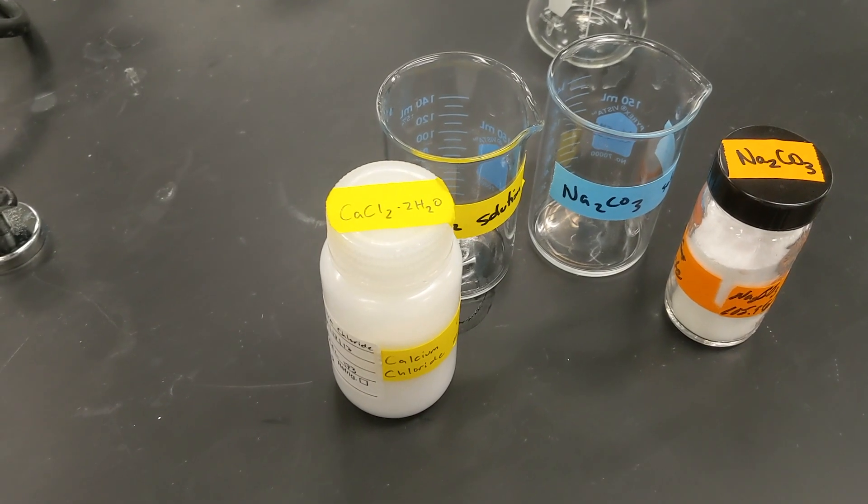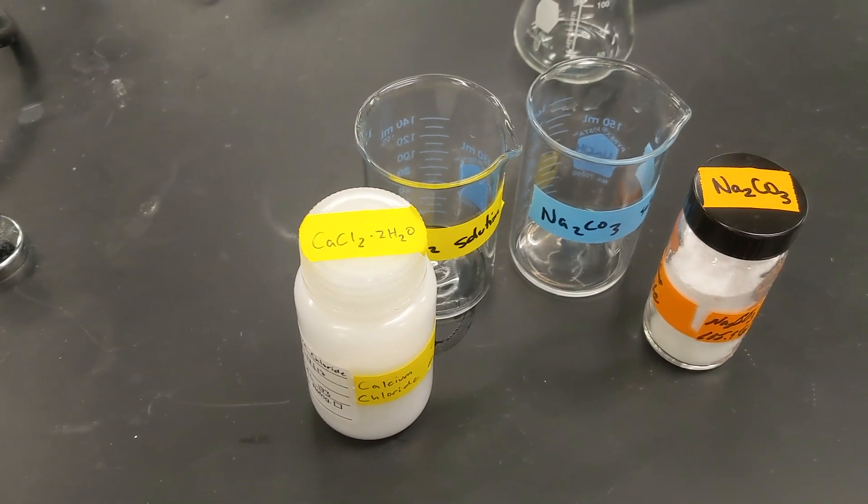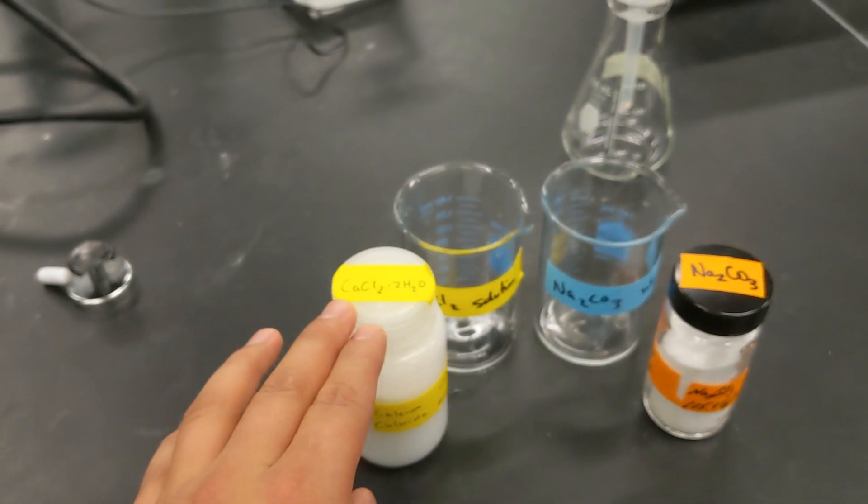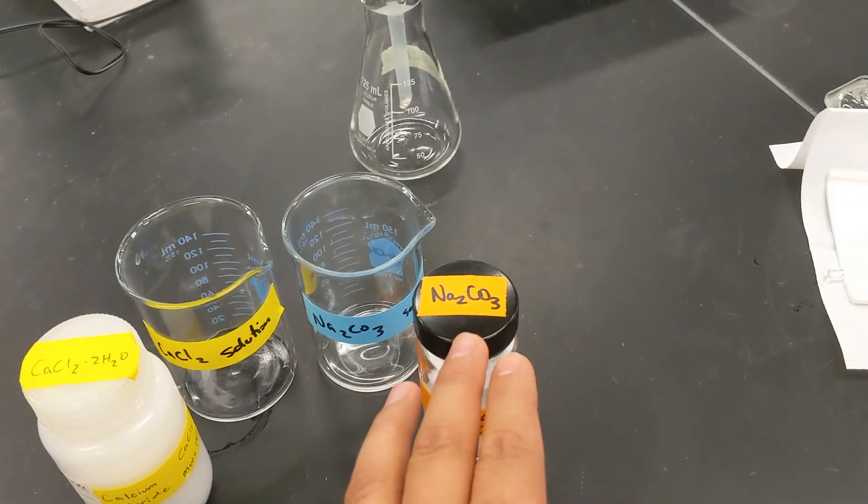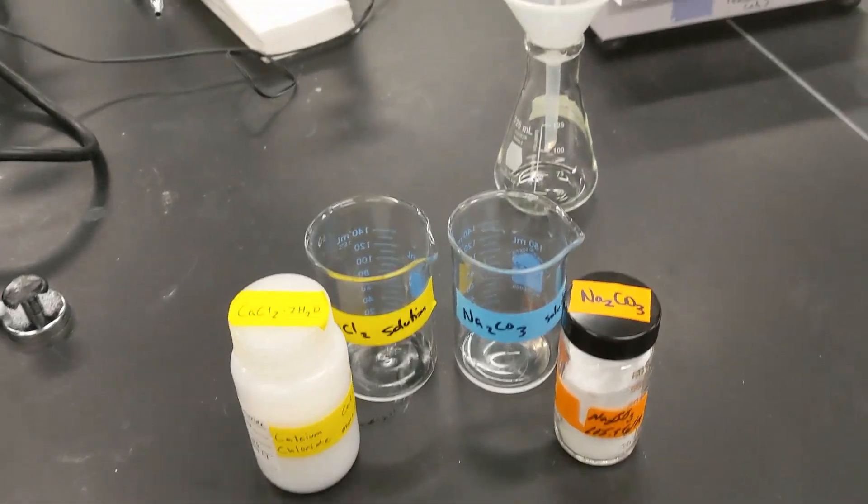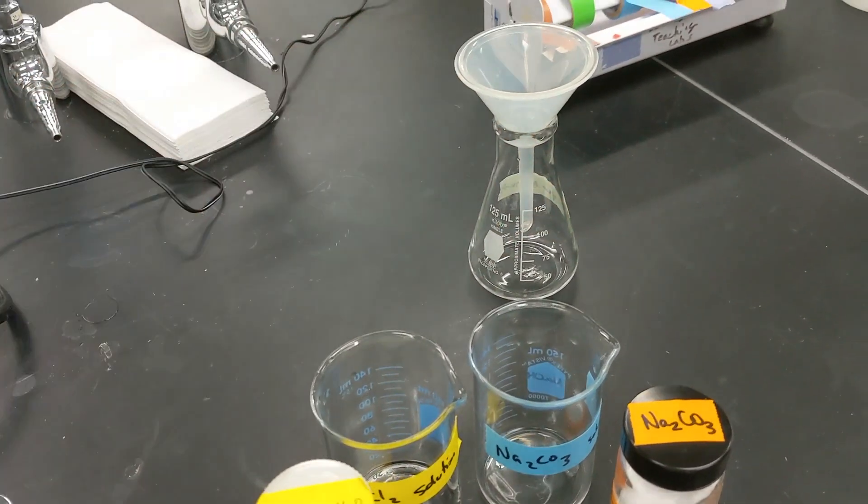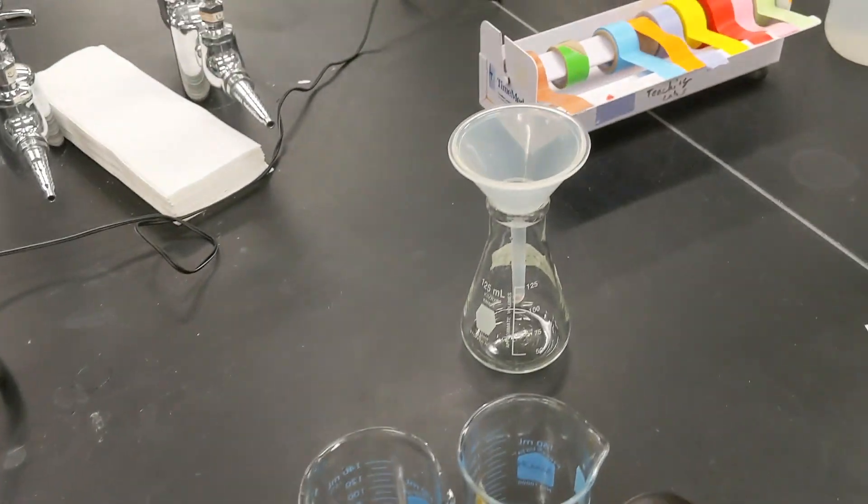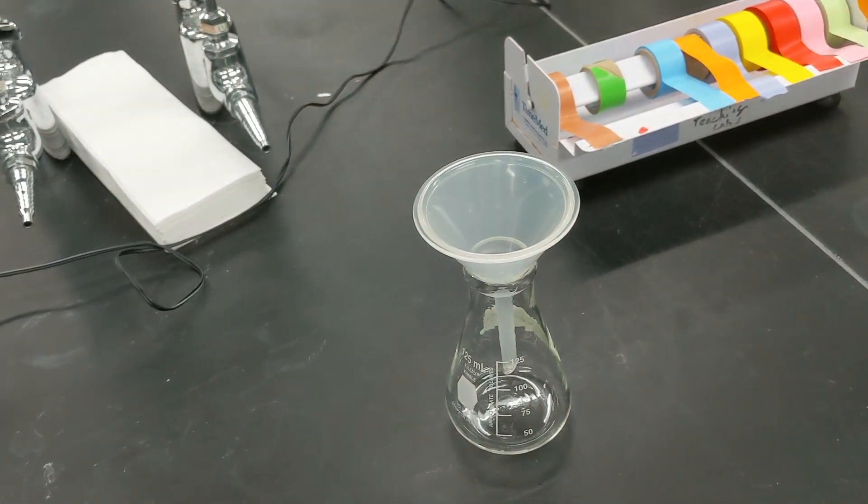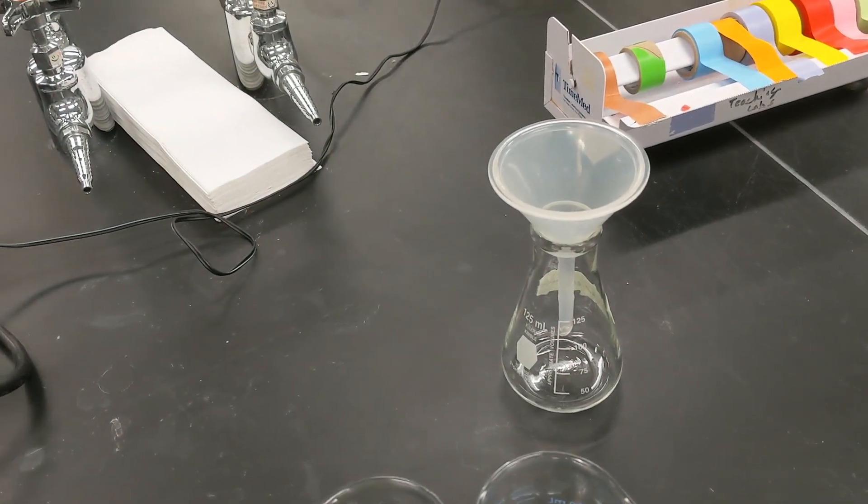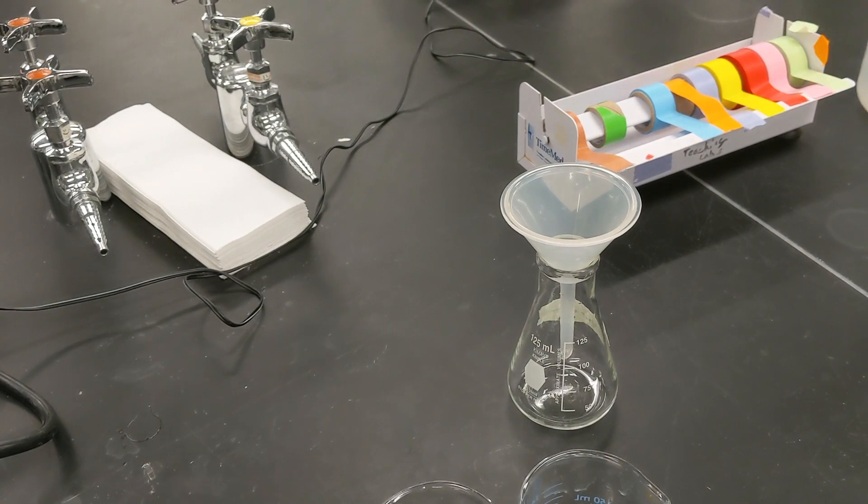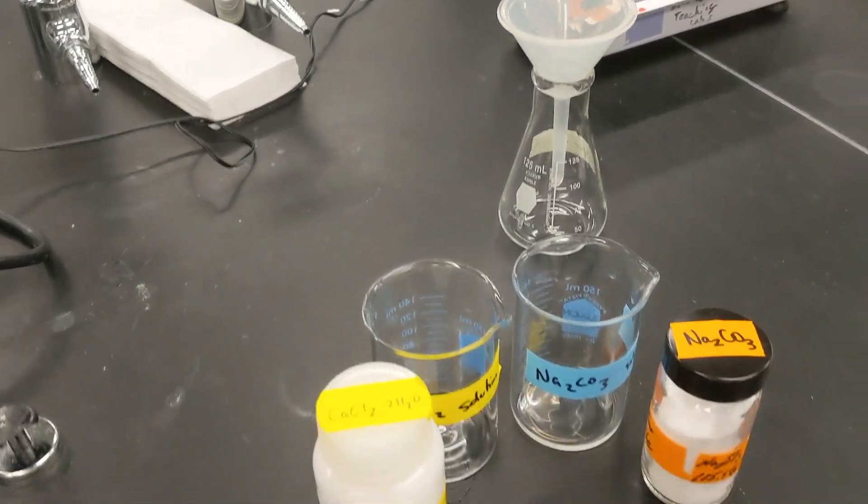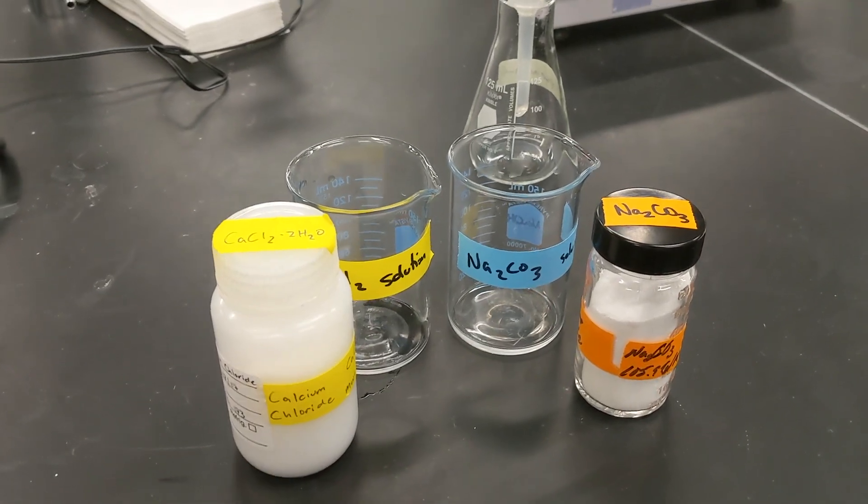So for today's lab we're going to be doing a gravimetric analysis procedure where we will have calcium chloride dihydrate and sodium carbonate, two different solutions in each beaker. We're going to combine them together to form a precipitant which will then be filtered from our filtering apparatus where we can catch the precipitant and dry it and weigh it and do some analysis on that. Let's get started.